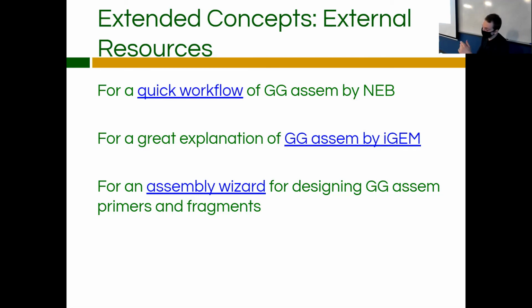I also included what is actually a really good explanation from iGEM itself. They have a YouTube channel, and they made a Golden Gate assembly video. I think it's just a seminar person discussing, and that's where I mainly learned this material. And then I also included that assembly wizard that I mentioned from NEB that allows you to insert your sequences, make sure they'll work properly, and it allows you to design your fully functional part at the end.